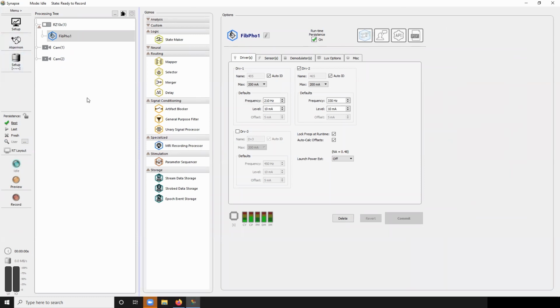So that about wraps up the initial training and everything that you probably need to know before doing something like an in vivo test. That's sort of the next step, and that has its own host of issues. If you've seen the recordings on RZ5, it's not going to be much different. Just make sure you measure the power. Make sure you're hooked up to the subject well. No gaps in the cannula, and you should be pretty good to go.